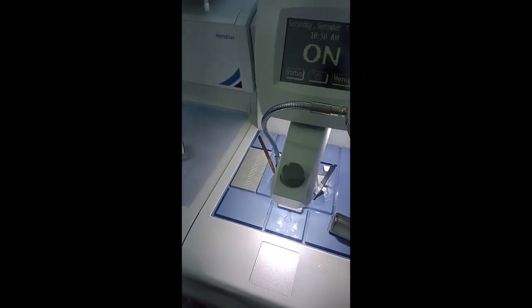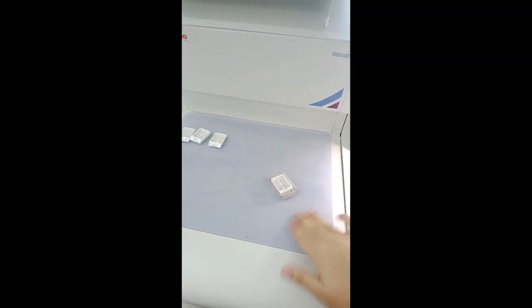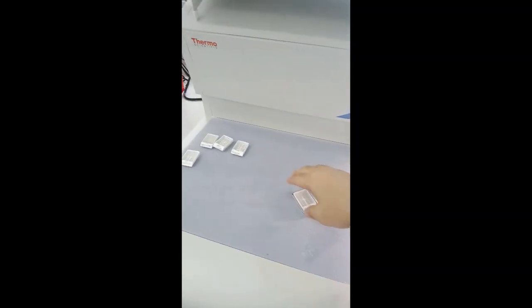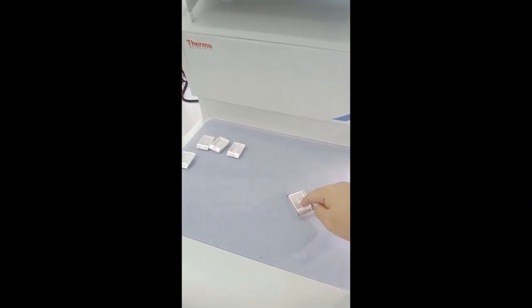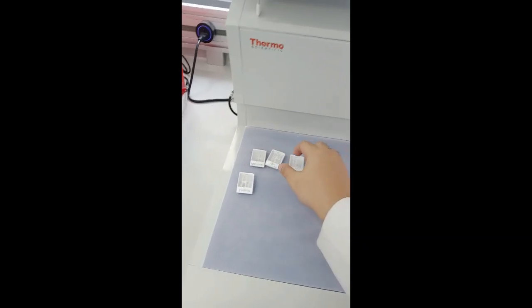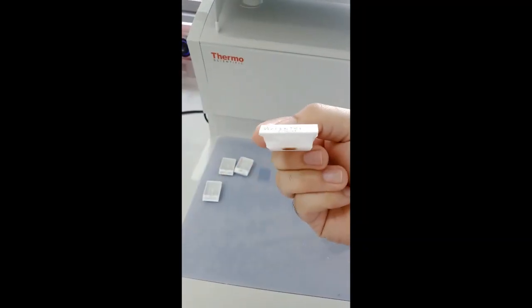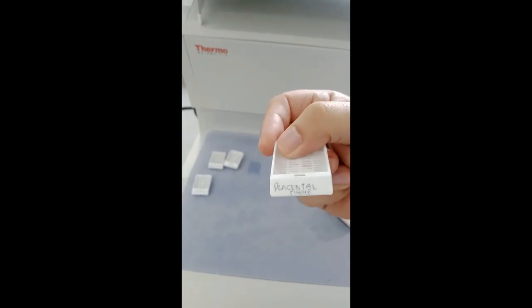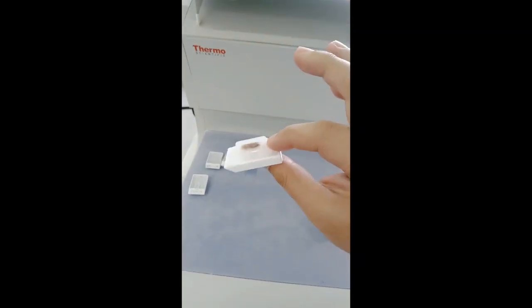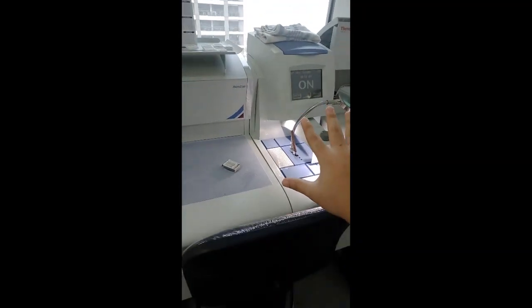Once the mold is filled with molten paraffin, we usually put it on a cold plate. This is ice cold, and this is an example of a tissue that's being cooled down. When the tissue is done, it will be transformed into these tissue blocks. This is an example of a placenta, a piece of placenta. And so that is the whole embedding process.